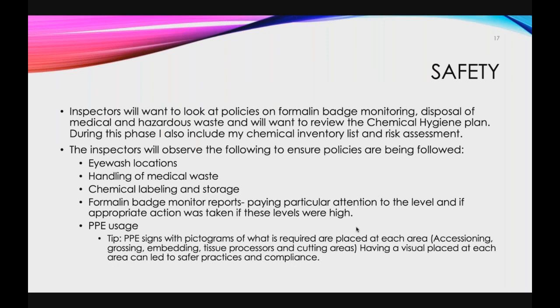Safety. Inspectors will want to look at policies on formalin badge monitoring, disposal of medical waste and hazardous waste, and they may want to review the chemical hygiene plan. I also include my chemical inventory list and risk assessment of my staff.